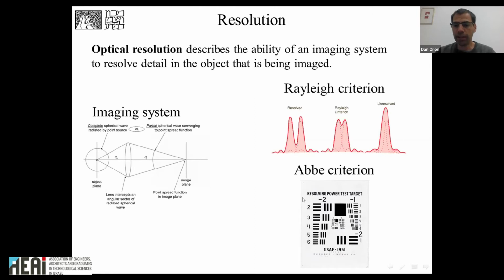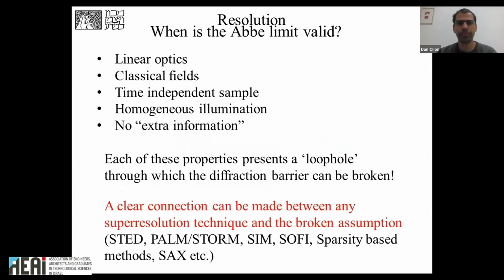That's actually the one that Abbe used in his paper. And that's, can you resolve a grating? If you look at a grating from sufficiently far away, you don't see the black and white stripes. It looks like a gray haze, like these small dots here, which are probably below the screen resolution that you have. So this looks gray. Here you can resolve the stripes. So the finest grating where you can resolve the stripes, that is the limit of resolution.